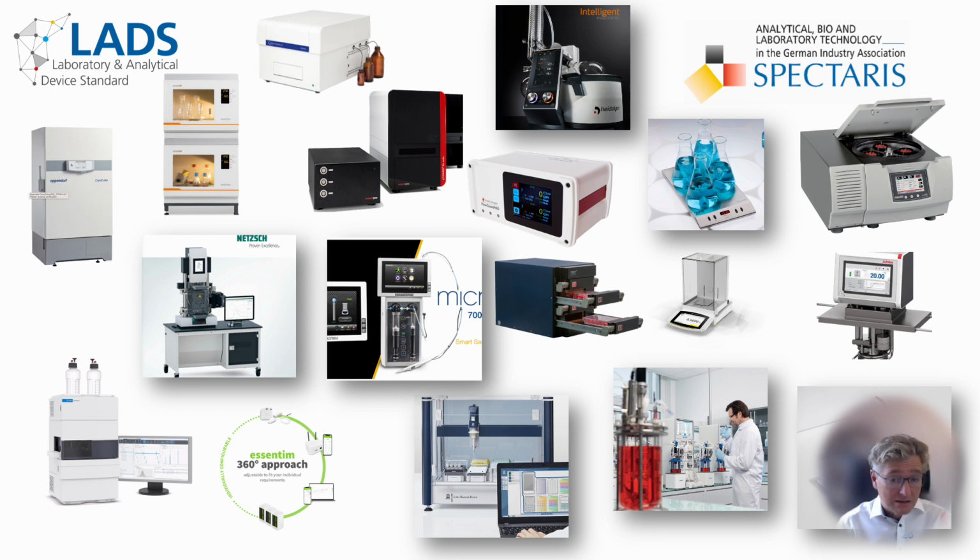However, upon closer examination, we realized that most equipment was not originally designed for automation integration, but for manual operation by human operators. This presents us with a challenging situation that requires automation of workflows with instruments not initially designed for automation, maintaining high flexibility due to frequent changes in laboratory workflows by ensuring close collaboration with human operators.